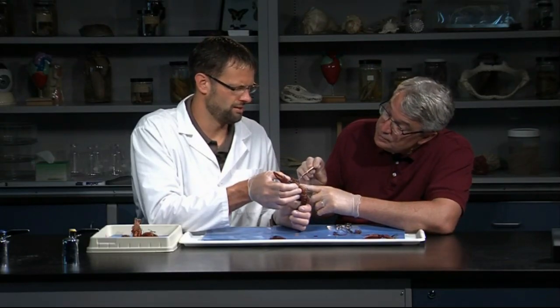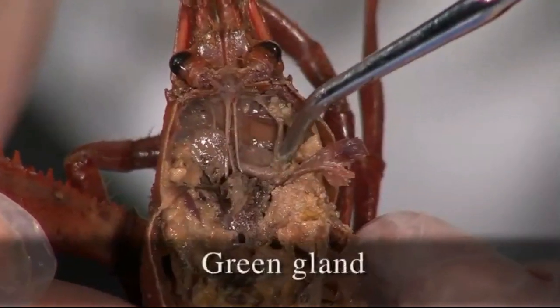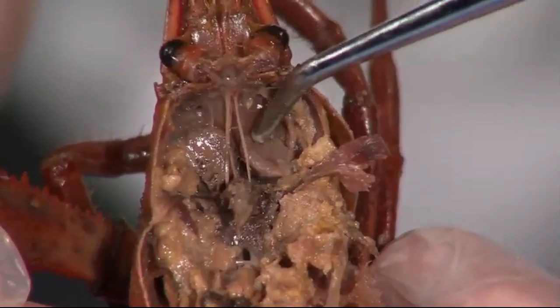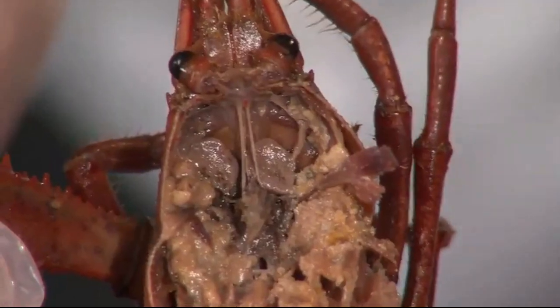How about excretion? Yeah, excretion — getting rid of body waste. They have some specialized structures called antennal glands, also sometimes called green glands. These antennal glands are right at the base of the antenna. When you remove the stomach, there's a pair of them — these sac-like structures right here. They take body fluids, remove the waste from the breakdown of metabolism, concentrate those wastes, and then excrete it to the outside through an opening. It's basically like urination for crayfish.